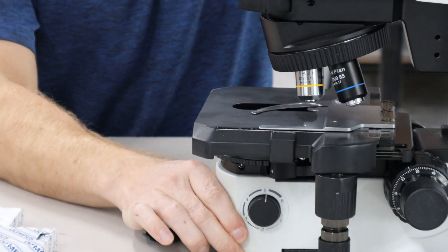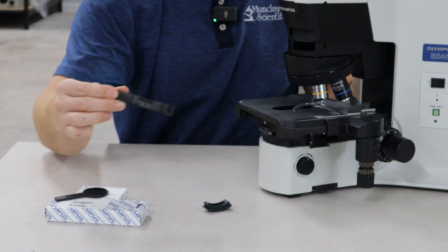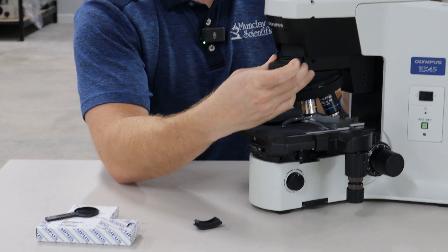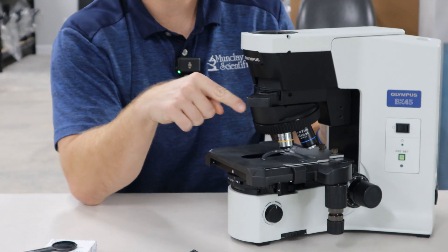A lot of folks will leave this in here and then just kind of pull it out and let it sit out of the light path.